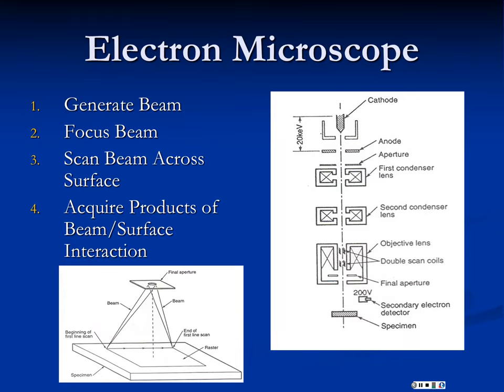The electron microscope, though, is a whole other animal. At the heart of the electron microscope is the electron gun and the electro-optical system. This is used for a lot of different instruments, and we can pull a lot of different kinds of information from a sample. The operating principles are identical to the cathode ray tube at the back of an old television set. Before flat screen TVs, you had those big deep TVs with the thing poking out of the back. That is essentially an electron gun.